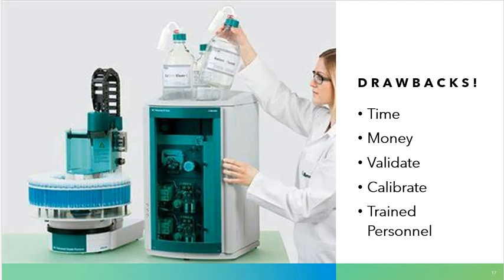All right. Next up, as far as drawbacks go, if I had to make a summary, and this is an IC system, by the way, that's what you're seeing someone using here. A lot of the problems with the instrumentation is, of course, the time. These are not very fast analysis times. Don't be surprised if these things take 30 minutes or more in order to process one sample. I don't know how many I could probably do in 30 minutes by hand. Probably tons, right? But this is the drawback of some of the instrumentation that you begin to use.